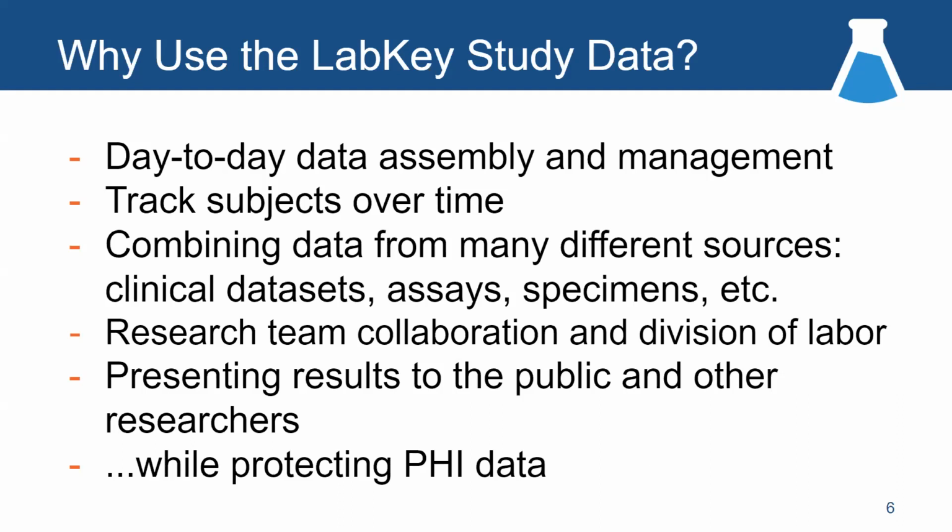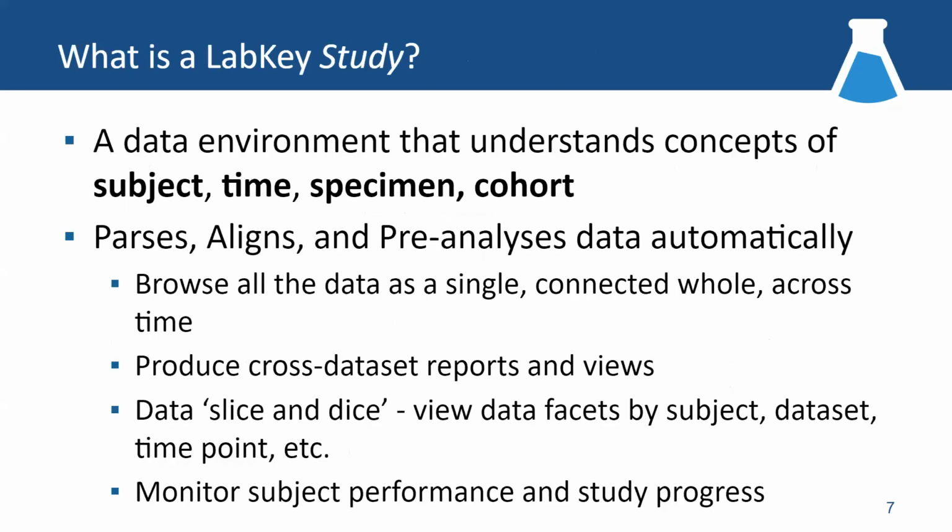The LabKey study features, or study module, we'll call them. Well, what is a LabKey study? Well, what it does is it is an active data parsing environment. It has concepts already built into it. Namely, I'm thinking of 4 main concepts.